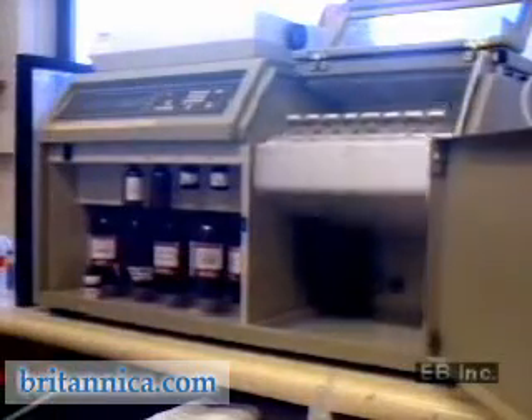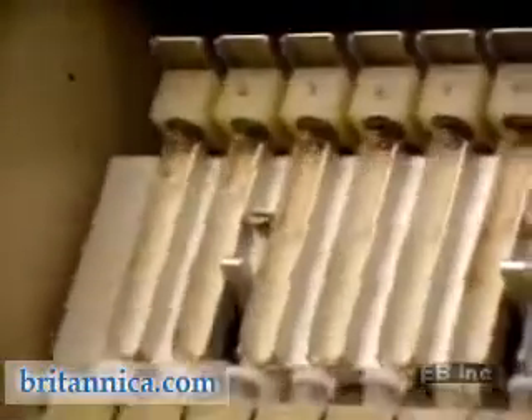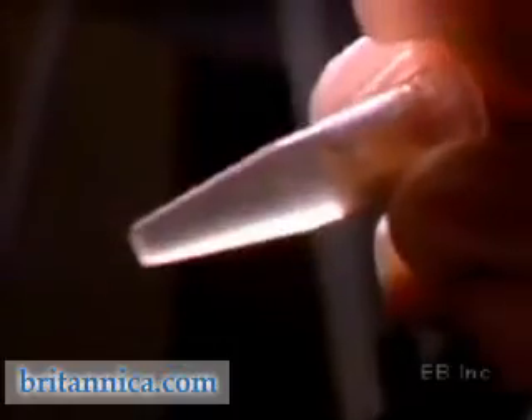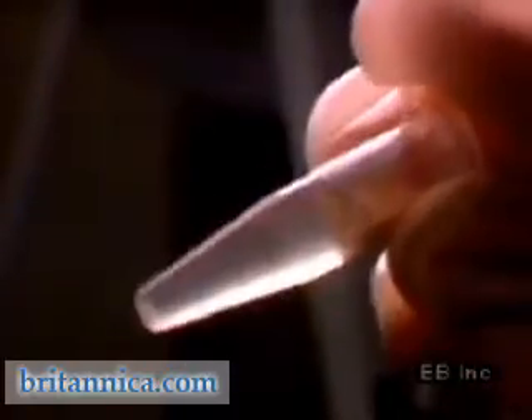Obtaining a genetic fingerprint begins with a sample of biological tissue. At Guy's Hospital in London, this research worker is using an automatic DNA extractor to produce a high-purity DNA fraction from a blood sample.